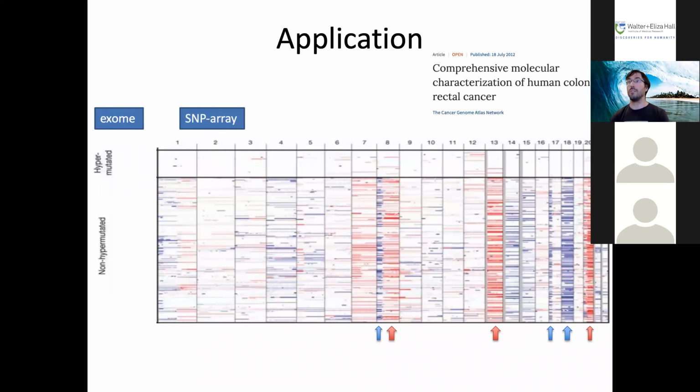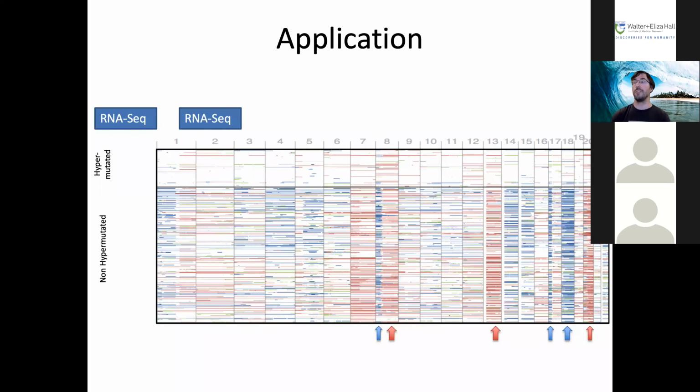So this is showing that not only on a single sample level, but also on a cohort level, we can use the RNA-Seq alone to reproduce the finding they used both the exomes and the SNP arrays for. This is very encouraging, and this makes us want to take this to cohorts with RNA-Seq only that don't have the DNA analysis already done. Maybe we can do this kind of analysis on cohorts with only RNA-Seq, where they haven't done copy number calling or point mutation calling.